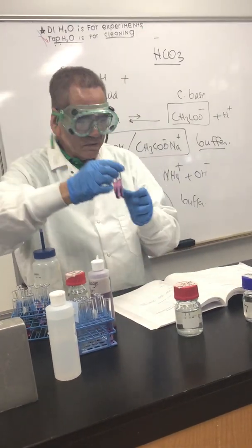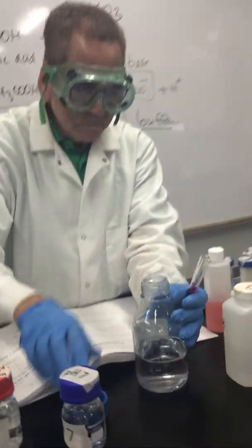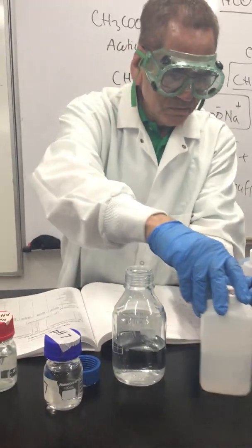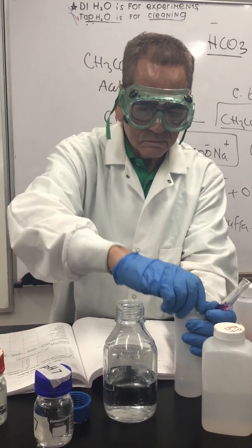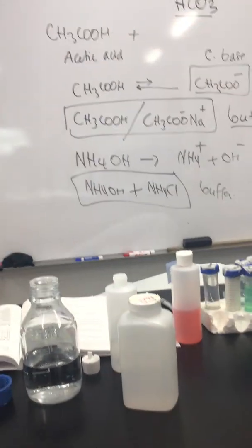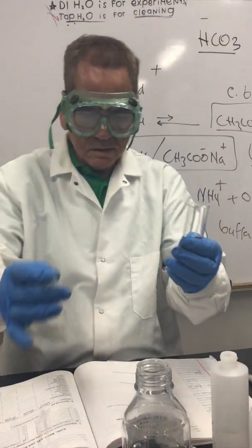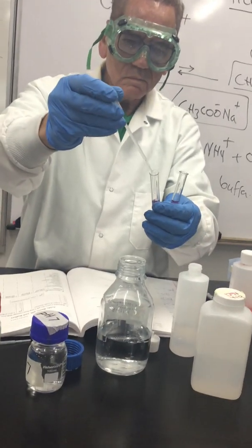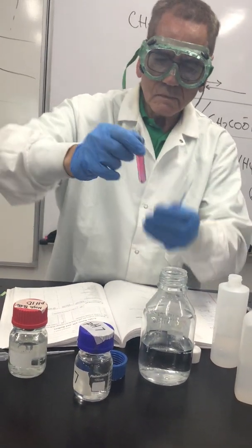Of course we know water is not a buffer. And we're going to test this buffer. One time we're going to add a drop of acid, and one other time we're going to add a drop of base. Okay, ready? On the first test tube that has water, I'm going to add a few drops of the acid. 1, 2, 3. And we shake it.